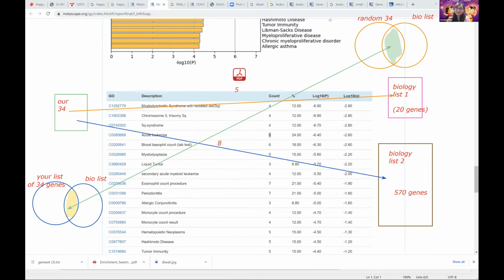Wow, it looks like a complicated web. So while we're at it, I'm also going to draw my favorite logo. Yay! That's actually my favorite logo, the little star.